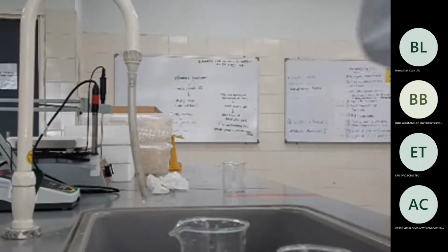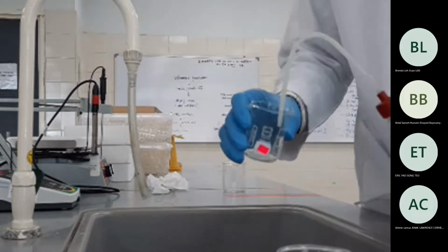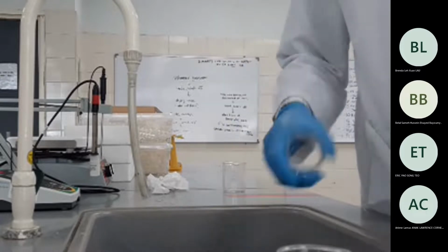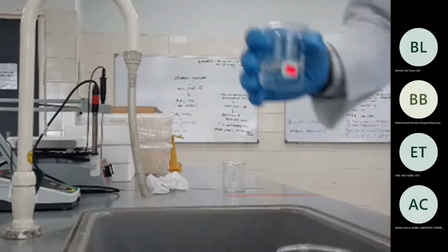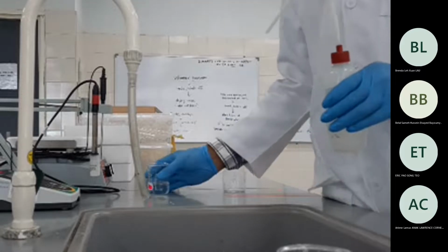You need water. All right. So these are clean. Record the temperature for today's lab, yeah? It is already 22.8 or 23, around 23.